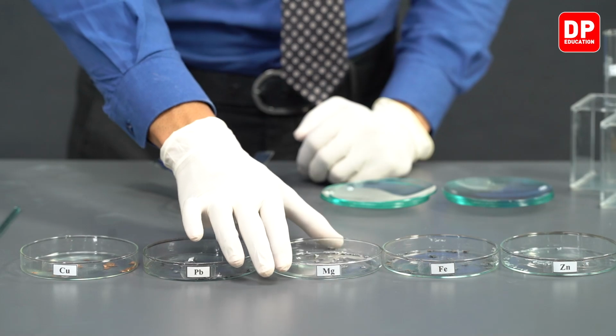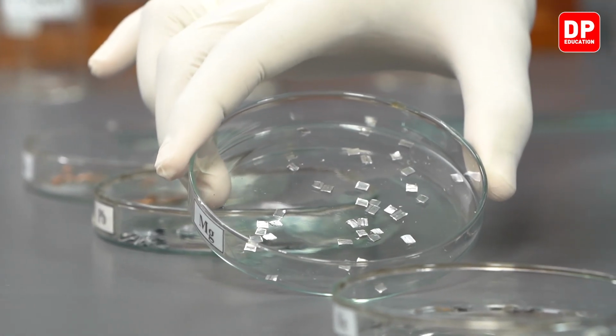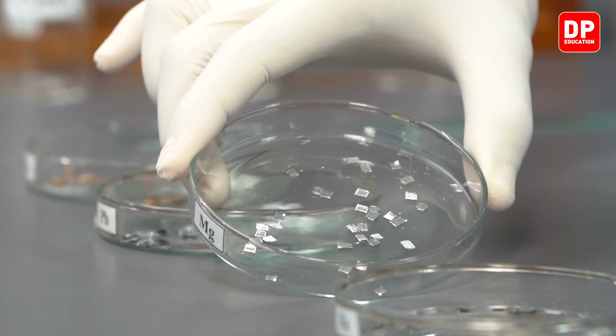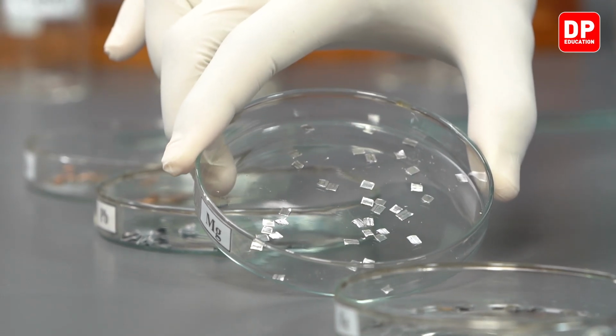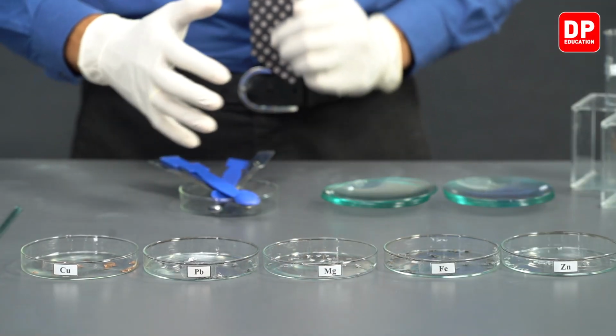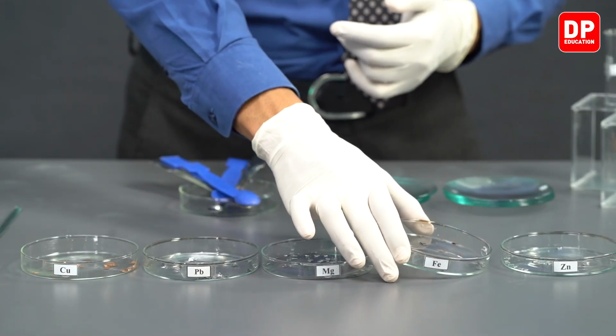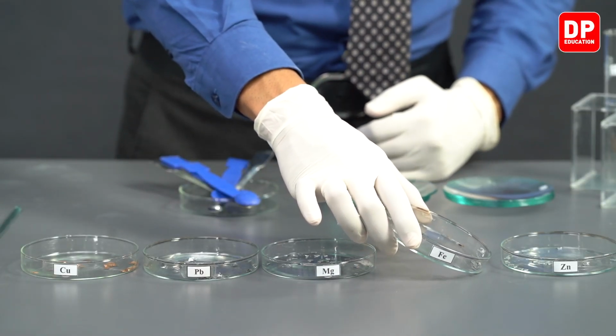And we have magnesium. Keep in mind, students, before you use magnesium, to clean the magnesium strip, otherwise there will be an outer coating that might interfere with our reaction. We have iron.